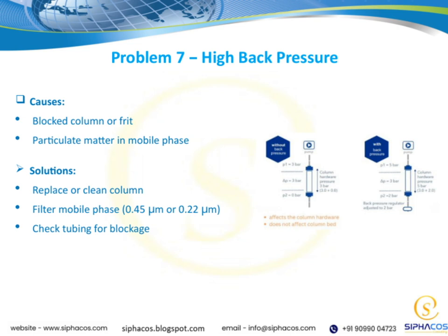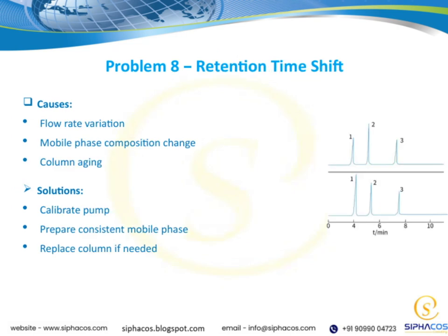Remember, high back pressure isn't just a nuisance. It can impact data quality and instrument longevity if left unchecked. Let's talk about problem 8, which is retention time shift. This is a common issue that can affect our analysis accuracy.